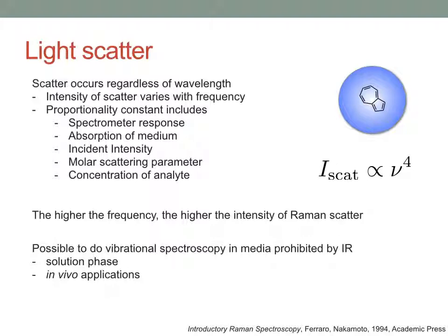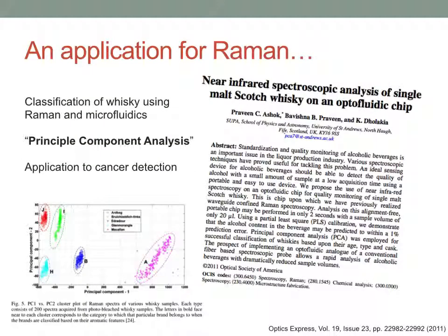Now, a friend of mine did some rather fun work using Raman. This is from the group in St Andrews, where they combined some microfluidics and some Raman spectroscopy to look at whiskey. It's a rather fun paper, one of those just-before-Christmas, let's-do-something-fun papers, on actually some quite serious work.